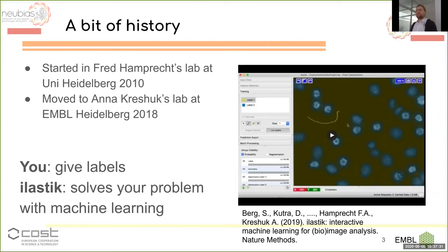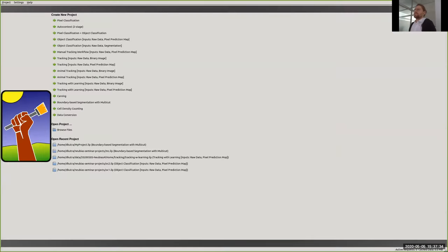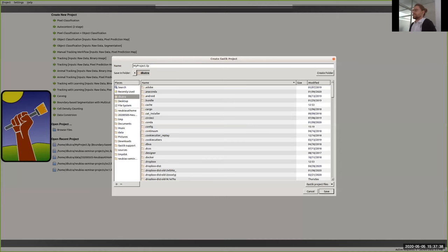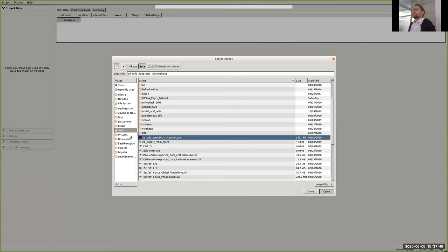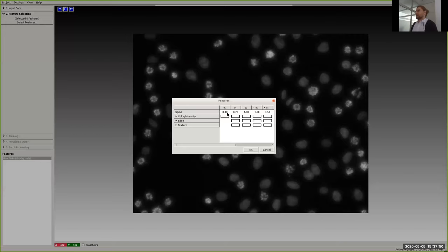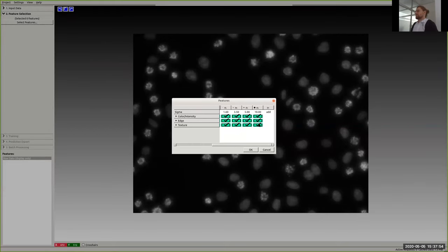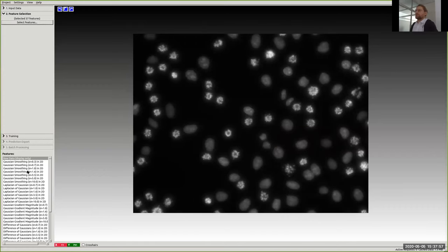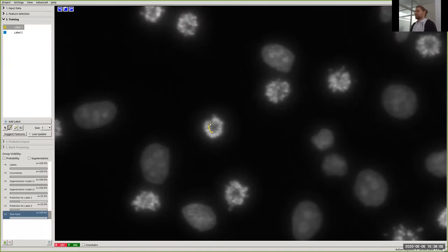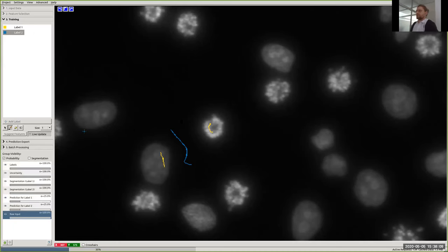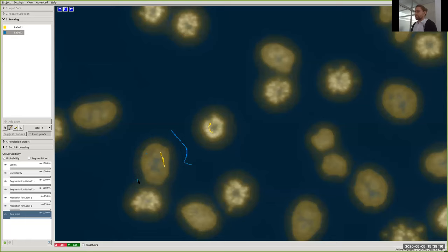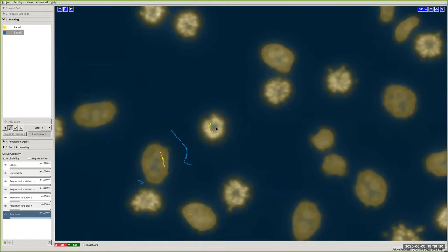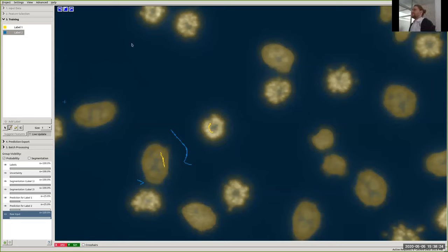I think I will do a quick pixel classification demo. If you open Elastic and create a new project, first you load some data — I'll use my favorite dataset. Then you select some features. In pixel classification we always say just select all of them and don't think too much about what they are — they are just different ways of looking at the same image. Then you provide some training data: you say this is a cell, this is background. You go to live update, get instant feedback, get a prediction, and you correct it where it's wrong. And so on. So now everyone has seen our workhorse.